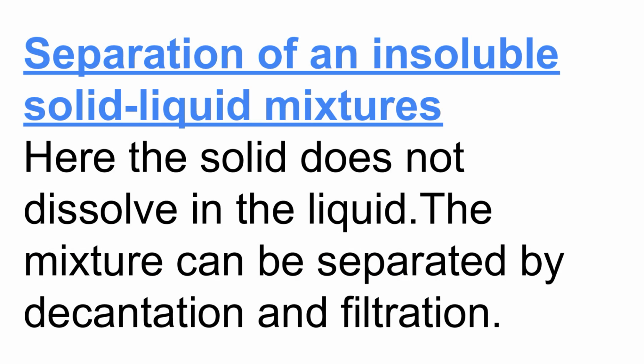Separation of insoluble solid-liquid mixtures. These are mixtures whereby the solid does not dissolve in the liquid, and therefore such mixtures can be separated by two methods: decantation and filtration. We are going to look at each one of them.